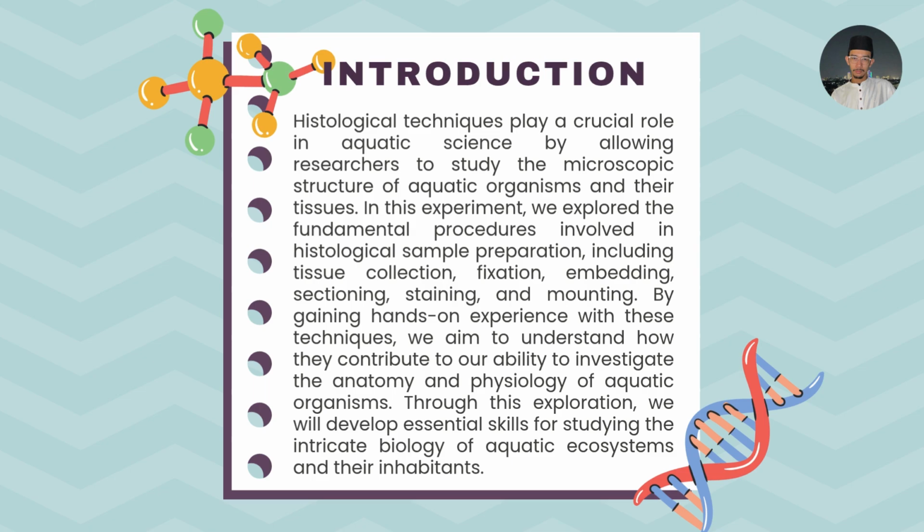Histological techniques play a crucial role in aquatic science by allowing researchers to study the microscopic structure of aquatic organisms and their tissues. In this experiment, we explored the fundamental procedures involved in histological sample preparation, including tissue collection, fixation, embedding, sectioning, staining, and mounting.